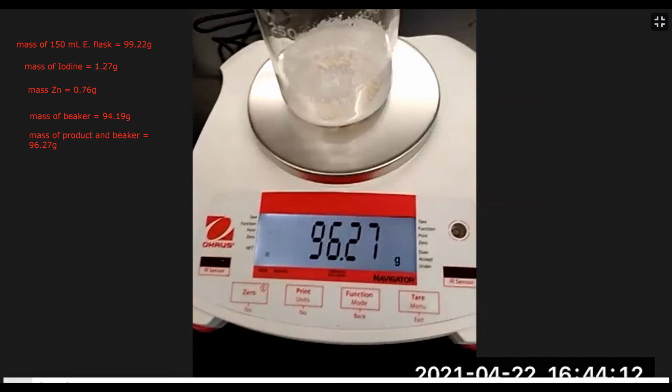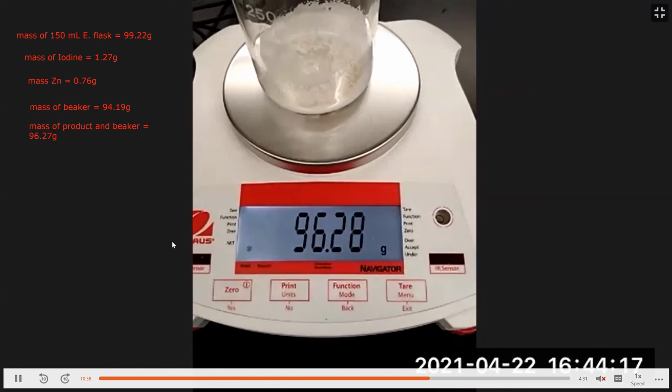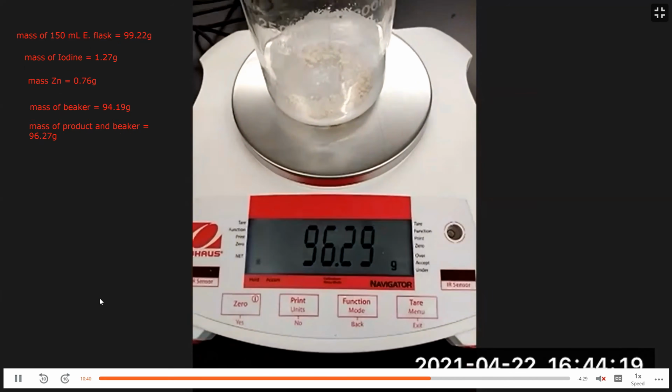That's the mass of the zinc iodide product. Now we're going to get the mass of the Erlenmeyer flask and the unreacted zinc.